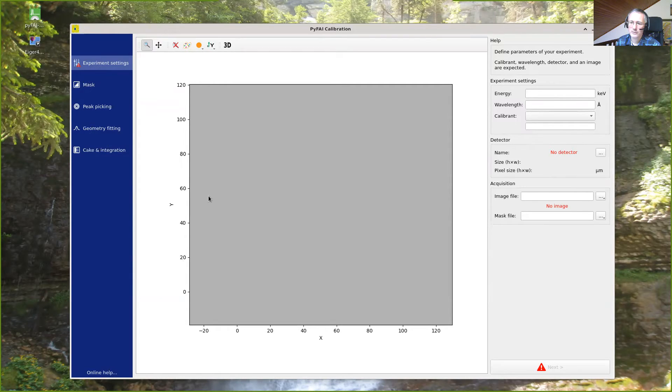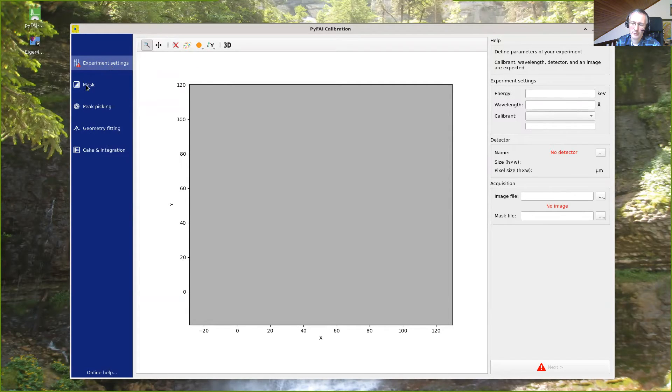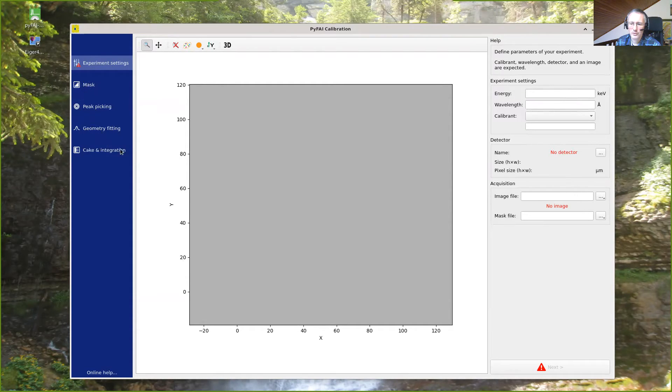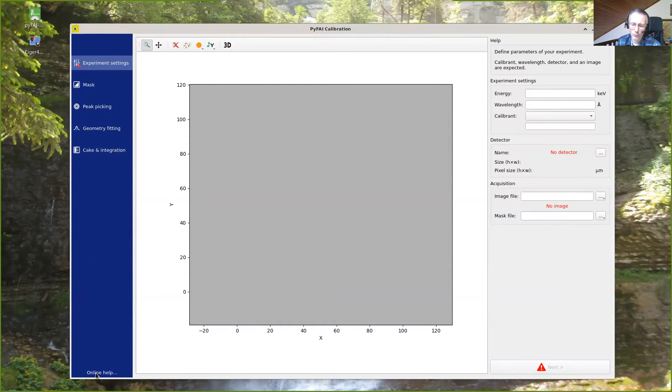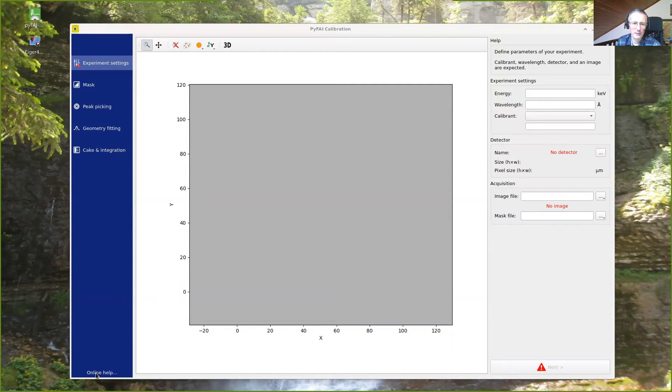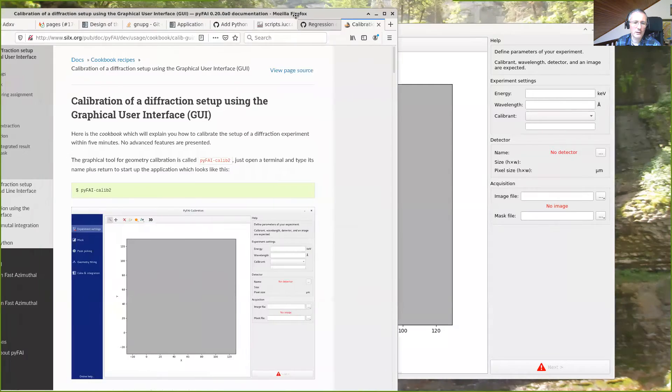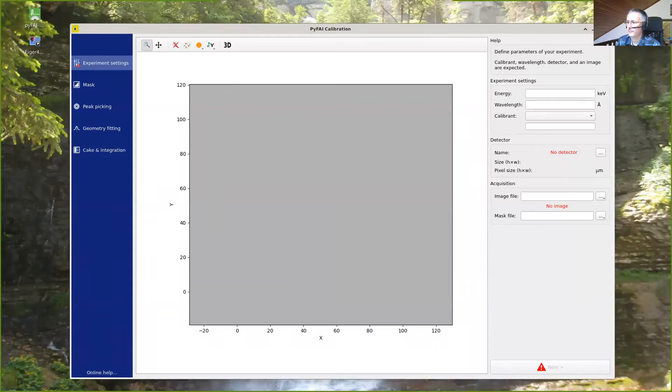So the steps to perform the calibration is first define some experiment setting, then mask out pixels, perform the peak picking, the geometry fitting, and finally perform the integration and save the result. You can always have access to the help by clicking on this button that will open the help directly on the page.